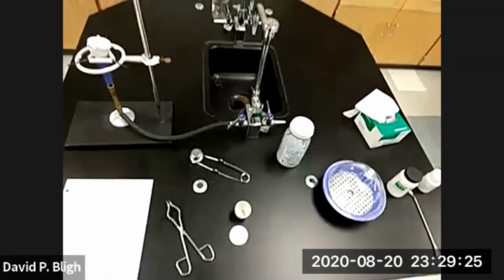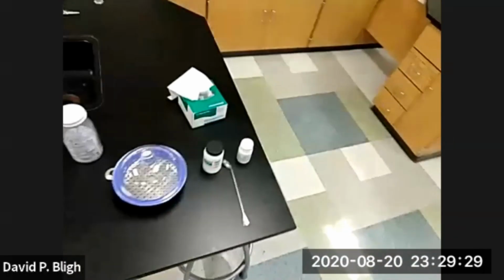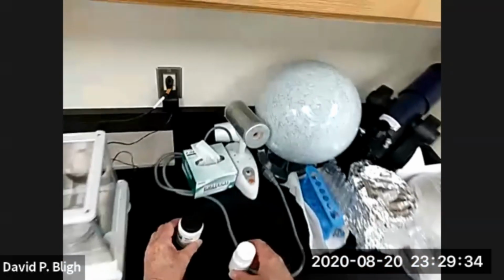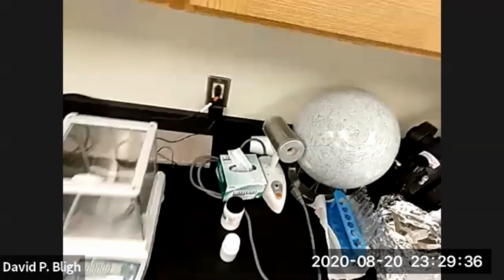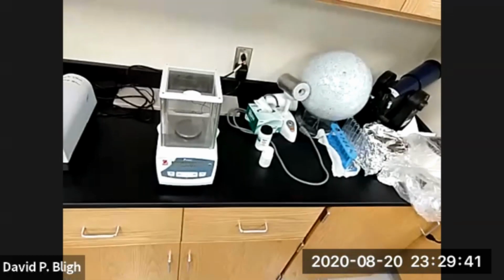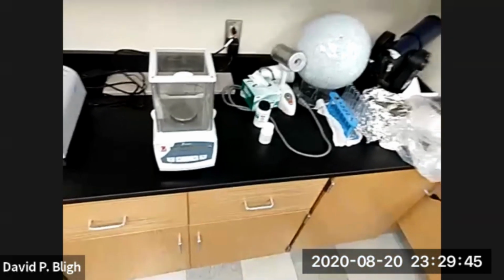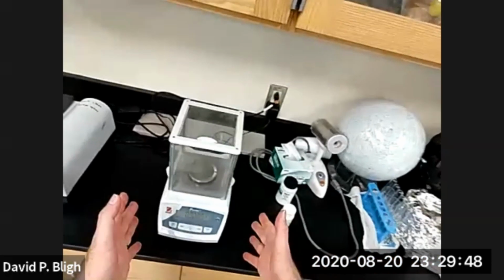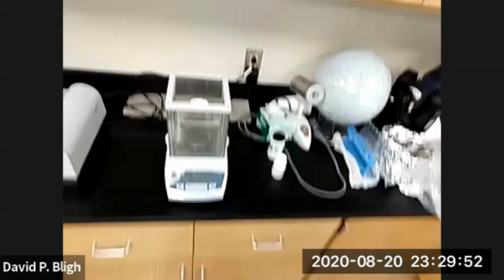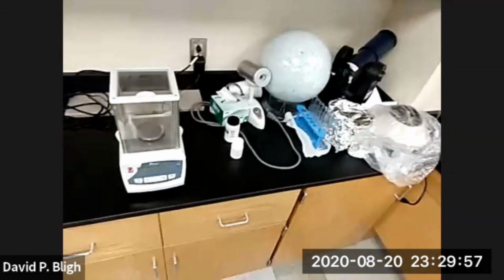Okay, while we're here and waiting for that to heat, there are some other things. We're going to take our compounds and put them over here by the balance because we need to measure the mass of each of our compounds with lots of accuracy, and we want to use an analytical balance, which gives us 4 decimal places of grams, or 1/10 of a milligram accuracy.